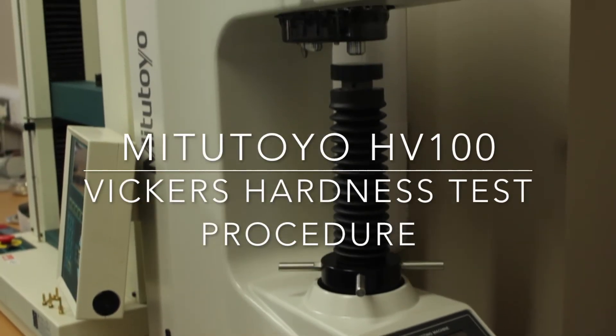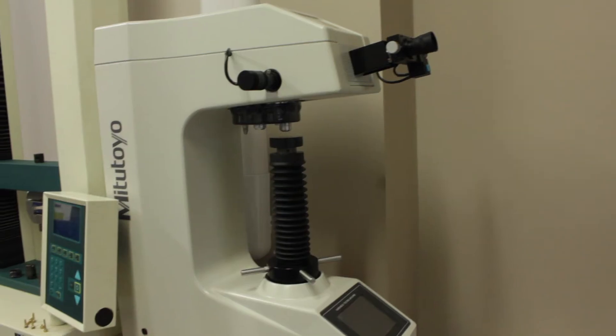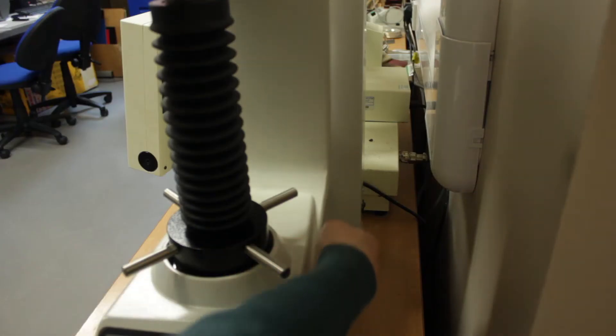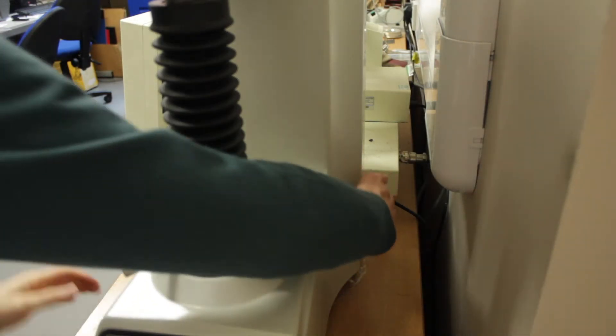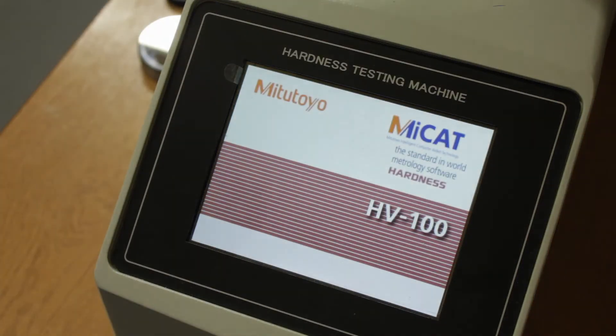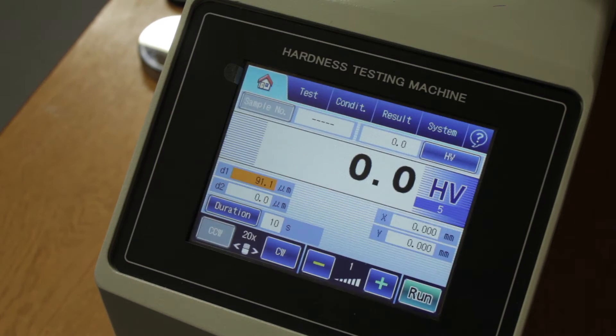This is the Vickers Hardness Testing Procedure on a Mitutoyo Vickers Hardness Tester. The first stage is to turn the machine on using the switch on the right hand side. Following this, the machine will boot and display the control screen.